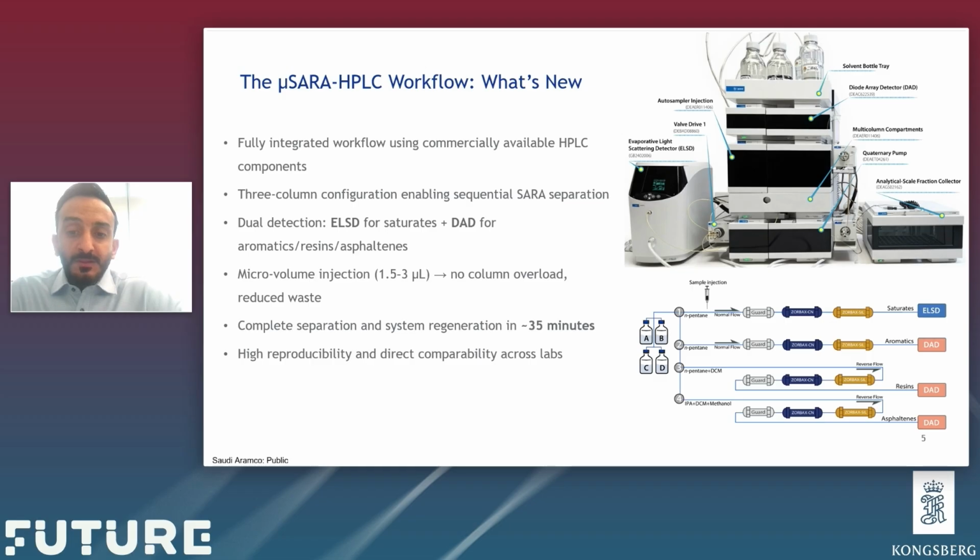A key improvement is the micro volume injection in our system, and hence the name micro SARA-HPLC. We use about 1.5 to 3 microliters of crude oil injection. This small volume helps us avoid column overload, reduce the solvent use, and maintain sharp fraction boundaries between the SARA classes.